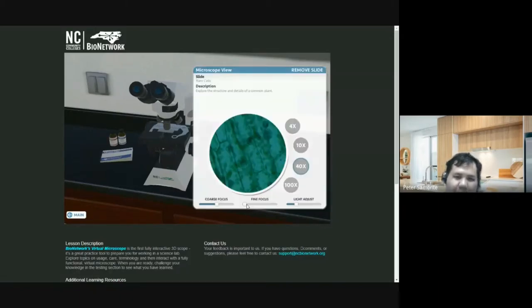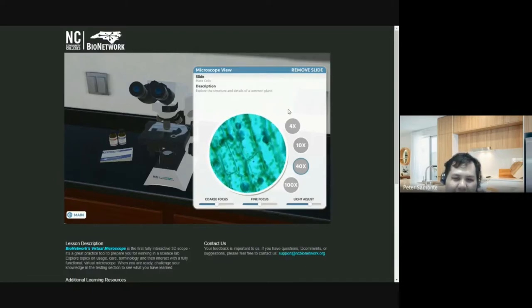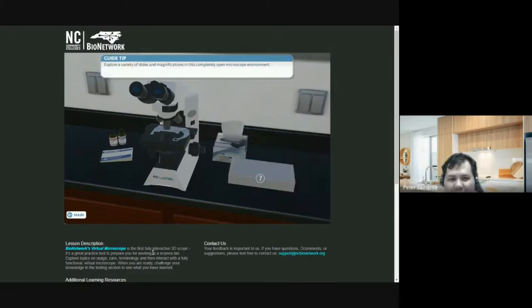Then we shift to HPO. So if you see, it's medyo blurry siya and medyo dark, so you adjust the light. Not too bright. It's enough. Yeah. So you can actually see the cell. Then let's say you want to remove the slide na. So gusto mo maglipat ng slide. You have to remember, class, yung paglilinis.